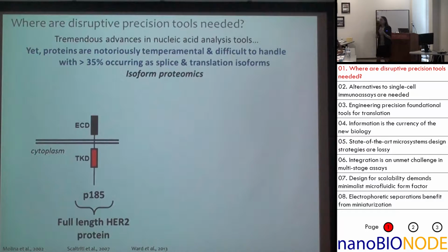Okay, so there's actually several different major classifications of breast cancer, just as there are other cancers as well. So there's ER, estrogen receptor, PR, progesterone receptor, HER2, which is this ERBB2 protein. It goes by both names. And basically, an oncologist, or a pathologist to be more accurate, who looks at a tumor that's been resected from an individual will stain that tumor slice to see which of these proteins are expressed.